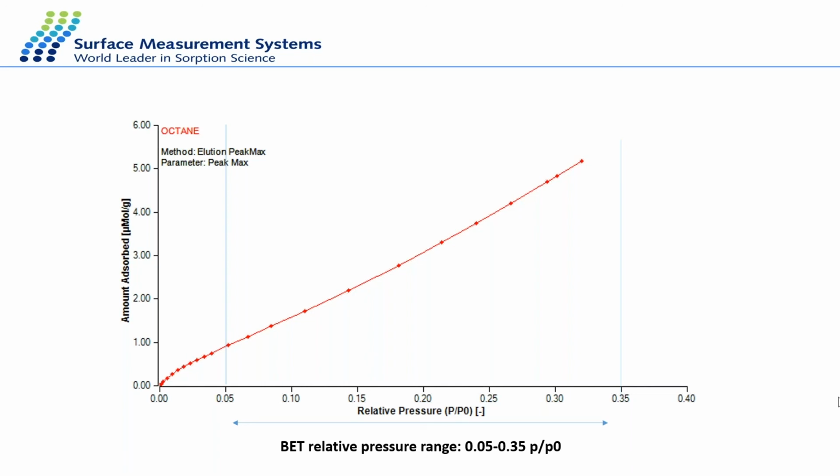So just to follow on from the question, will humidity help? I don't think so, because with humidity you measure another effect. So I wouldn't use humidity at the beginning. First, I would try to find the best parameters to absorb and desorb the probes, and then move on to humidity.